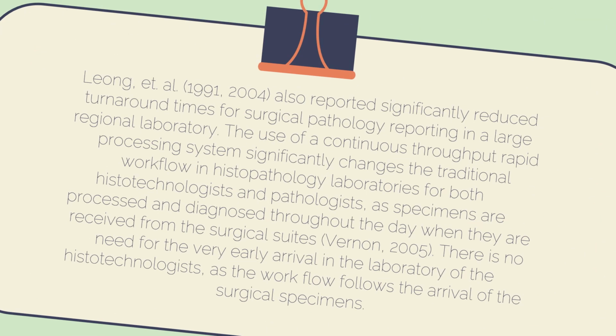It also reported significantly reduced turnaround times for surgical pathology reporting in a large regional laboratory. So the use of a continuous throughput rapid processing system significantly changes the traditional workflow in the histopathology laboratory for both the histotechnologist and also the pathologist, as specimens are processed and diagnosed throughout the day when they are received from their surgical suites. So there is no need for the very early arrival in the laboratory, as the workflow follows the arrival of the surgical specimens.